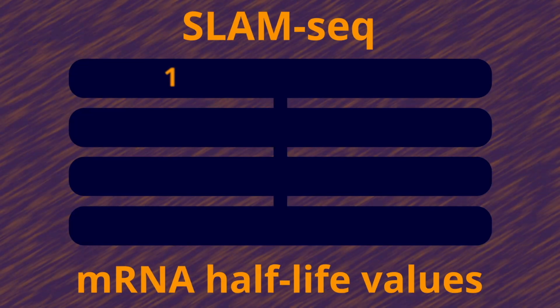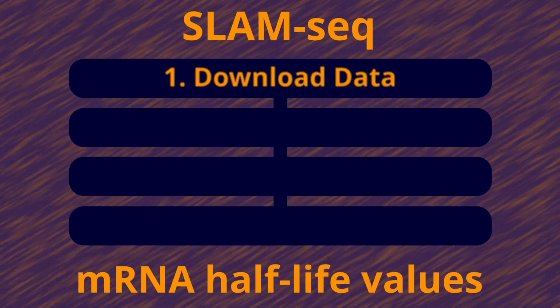Hi, in this video we will cover how to determine half-life values from SLAM-seq data. I will walk you through the 4 necessary steps to go from raw data to calculating mRNA half-lives. Alright, let's dive into the first step, downloading and setting up your data.